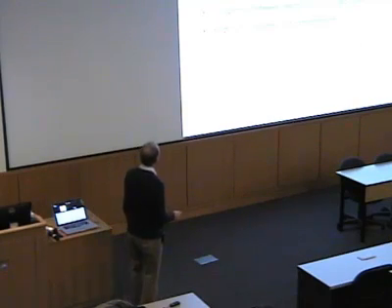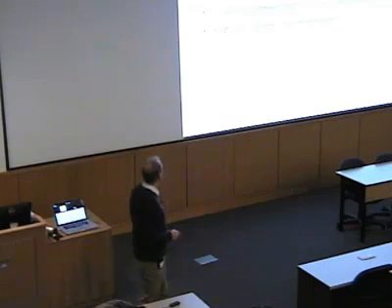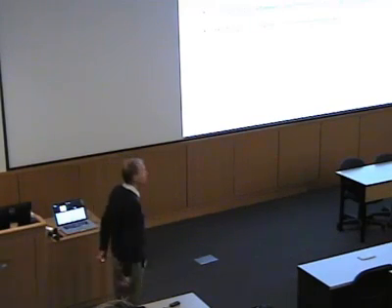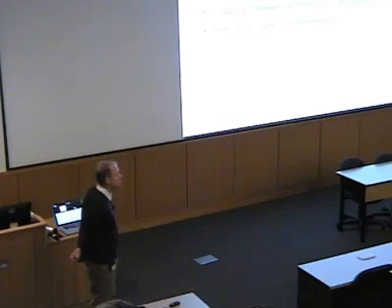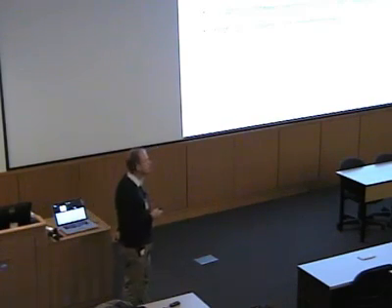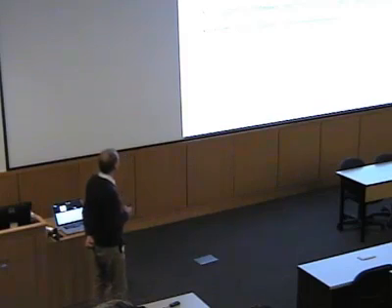Okay, so here's an outline of what I'm going to try and get through in the next hour and a half. I'm going to start by talking about just the basics of the EPR experiment, so how we actually do this experiment, what's the underlying physics of it, and along the way we'll bring in various interactions which influence EPR data. I'll also talk a fair bit about the technicalities of doing the EPR experiment.